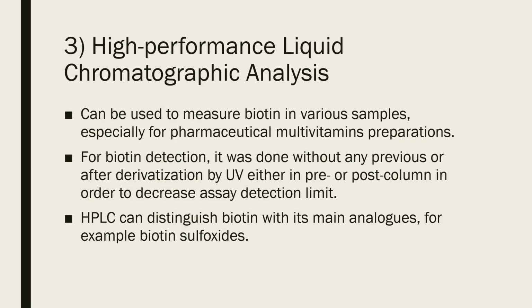Next, let's proceed with another biotin analysis, which is high-performance liquid chromatography, also known as HPLC analysis. This method can be used to measure biotin in various samples, especially for pharmaceutical multivitamin preparations.